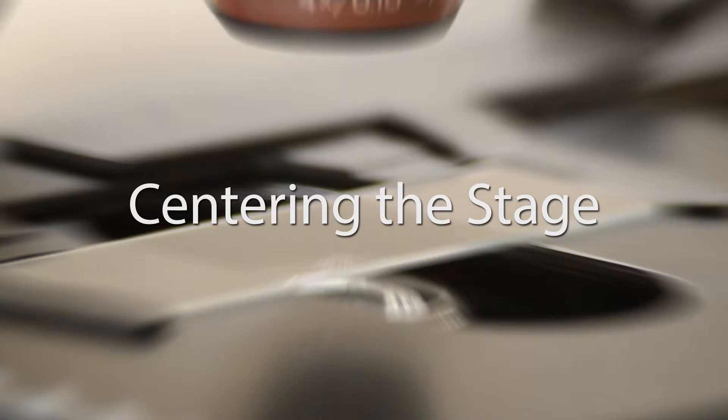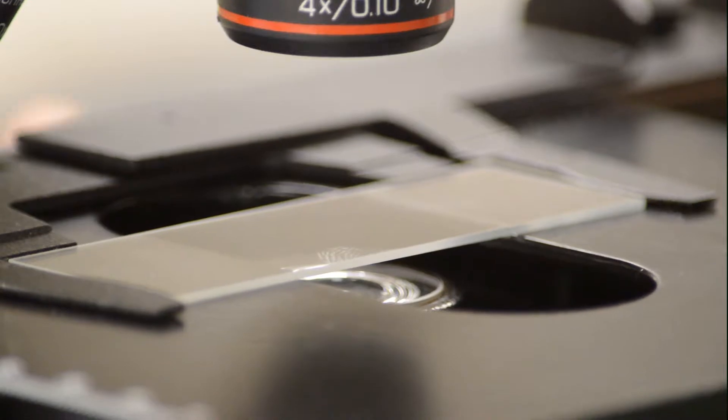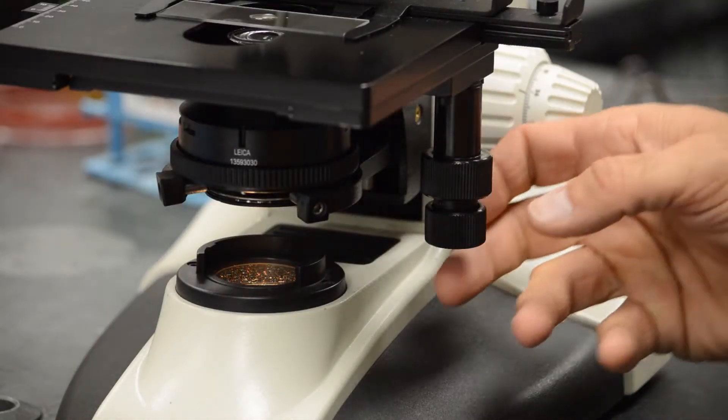This video will look at several different parts of using the microscope. The first step is to place the slide on the stage, and once you have the slide on the stage it becomes necessary to be able to center the slide so that you can view. There are two knobs on the side of the stage.